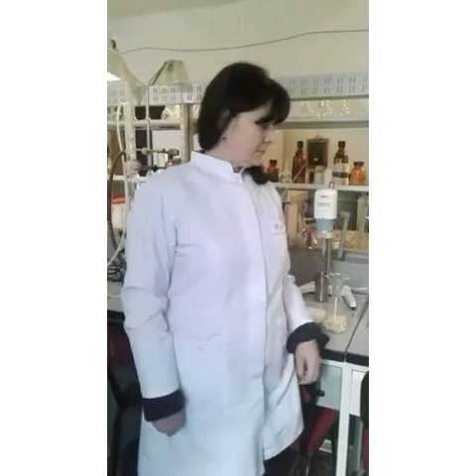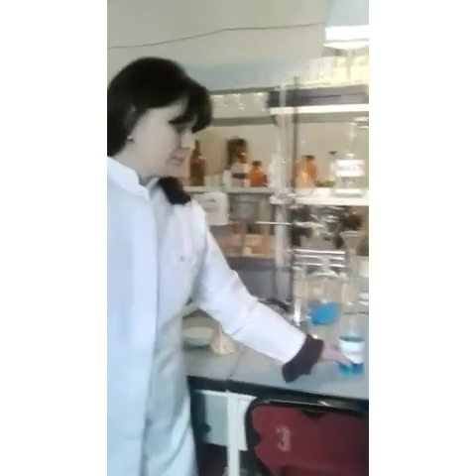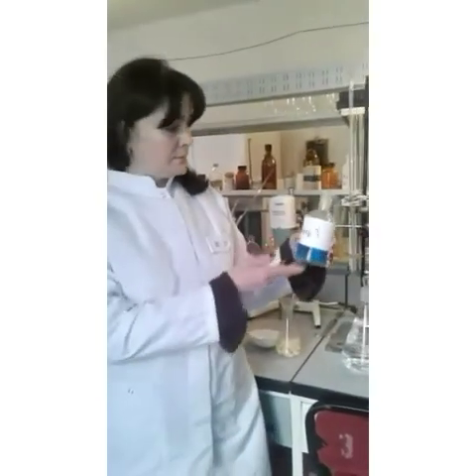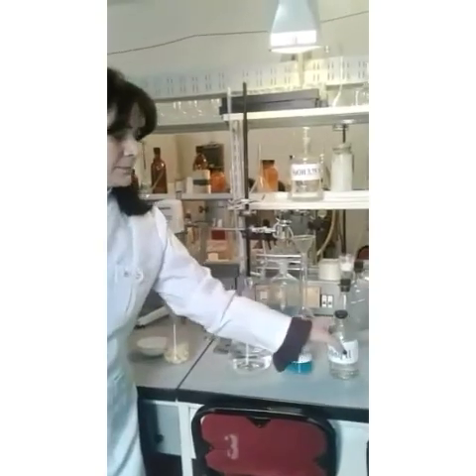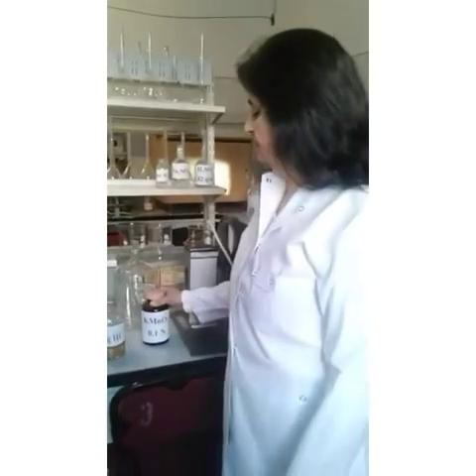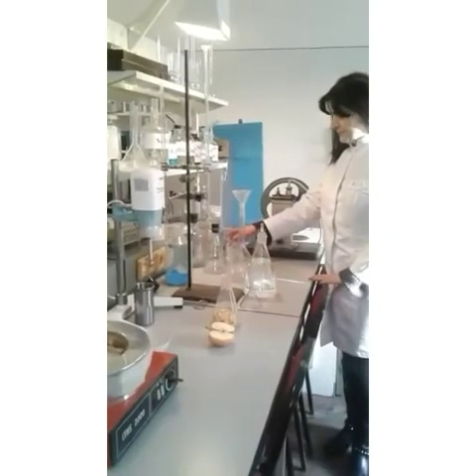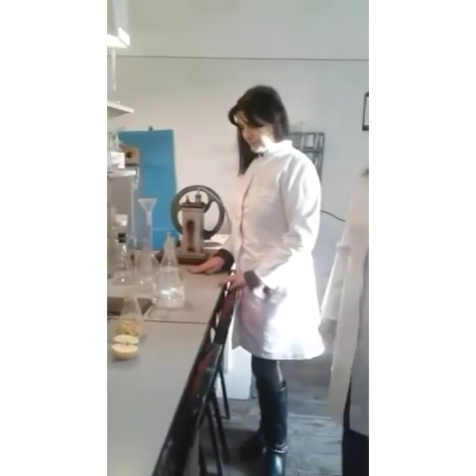These are reagents prepared by my assistants: Fehling 1, Fehling 2, solution 3, and solution 4. We prepare 50 grams of apple.